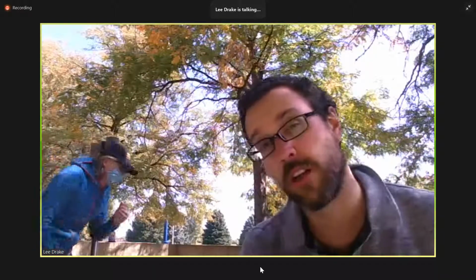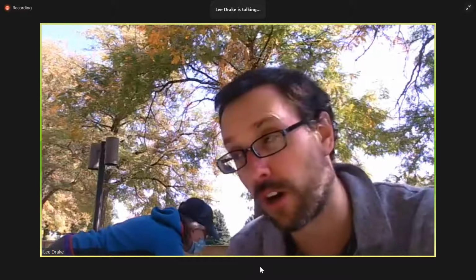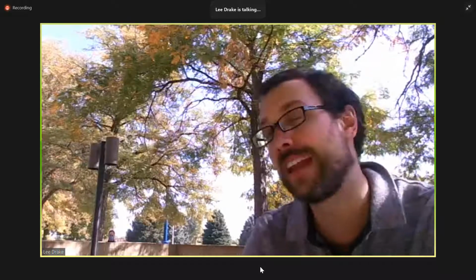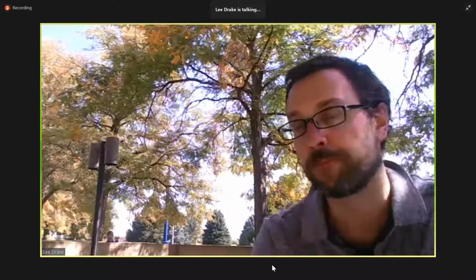Drop your current to as low as you can. And this sounds counterintuitive because it means your count rate is going to be very low, and just measure for about 4 to 5 times longer than you would normally. So if you normally measure for a minute, maybe do 5 minutes at a low current with an extremely high filter. And that's going to give you the best accuracy for these trace metals that are present there.